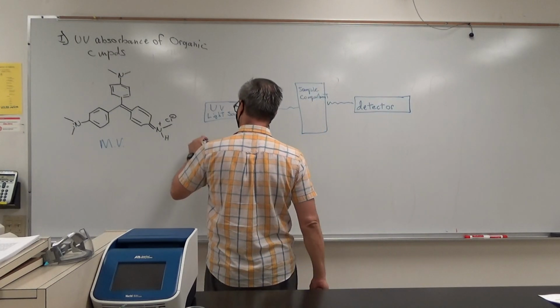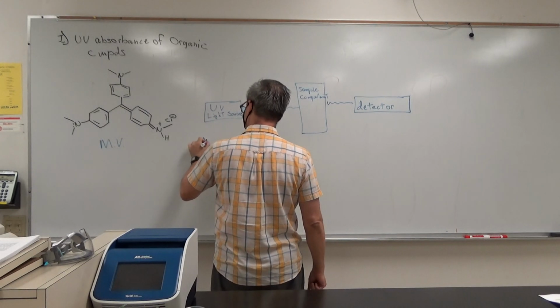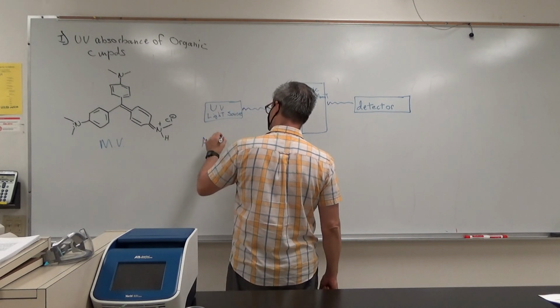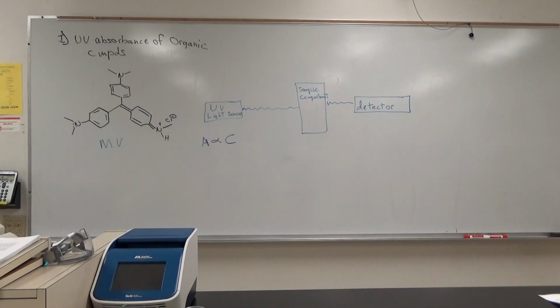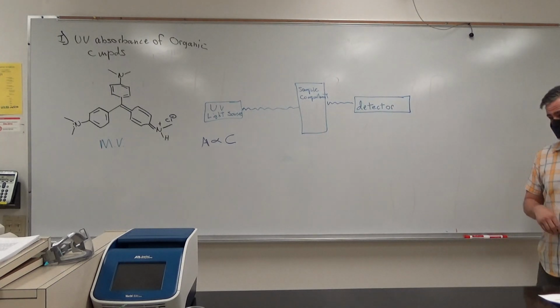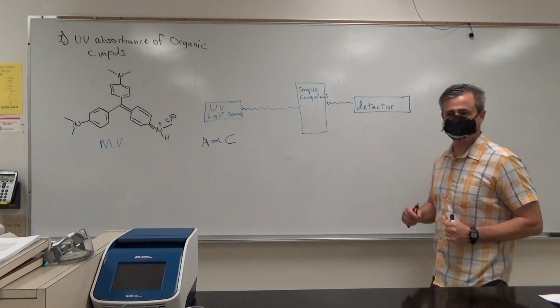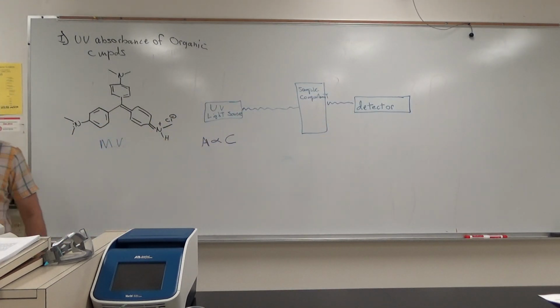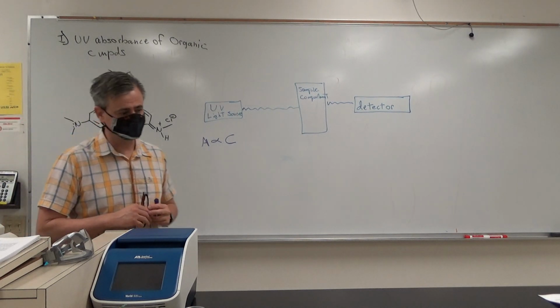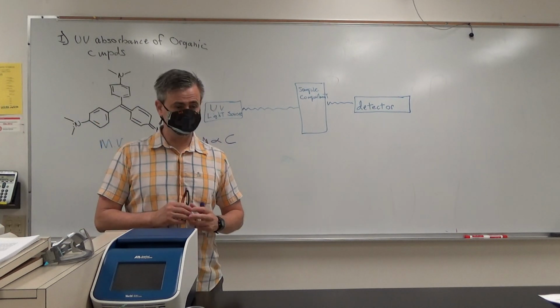So, absorbance is proportional to concentration. Okay. All right, what else? What else is going to affect whether I can get out that other end and get to this detector without running into a molecule that's going to absorb me?